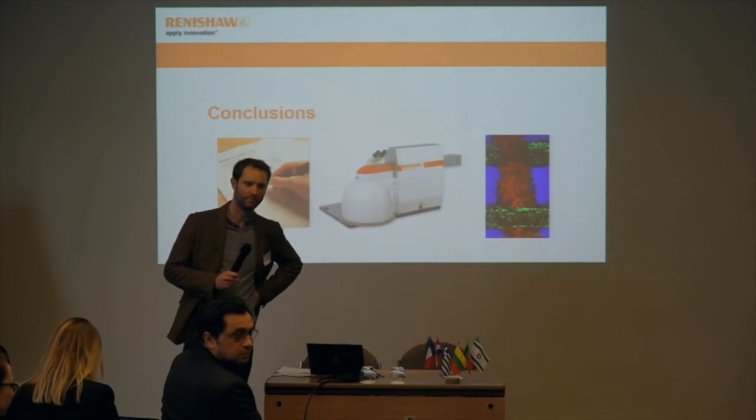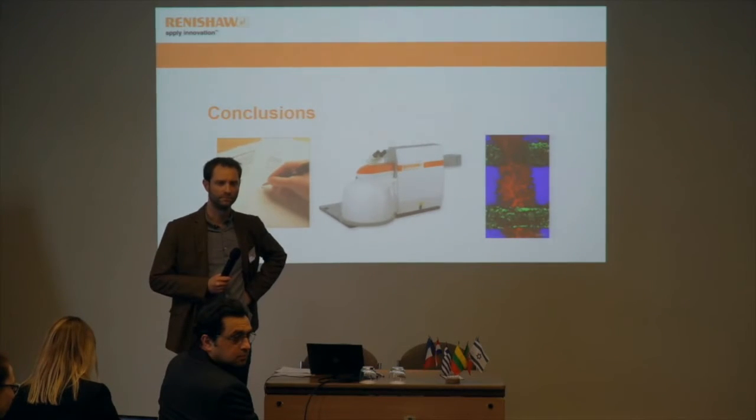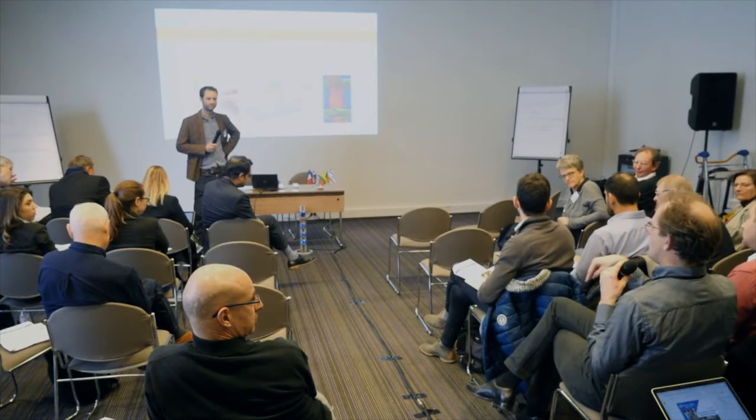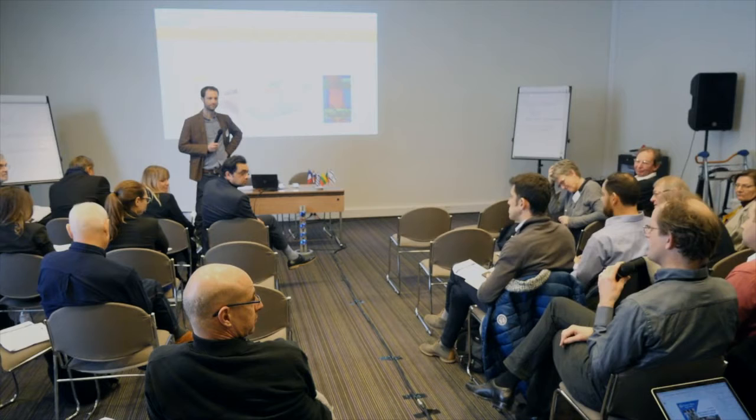The stage was meant for reflectance measurement, so it was completely black, solid metal, which is not very good for transmission measurements. But we cut a hole in it. I asked the technician to cut a hole in it, and it's now useful for transmission measurements as well.